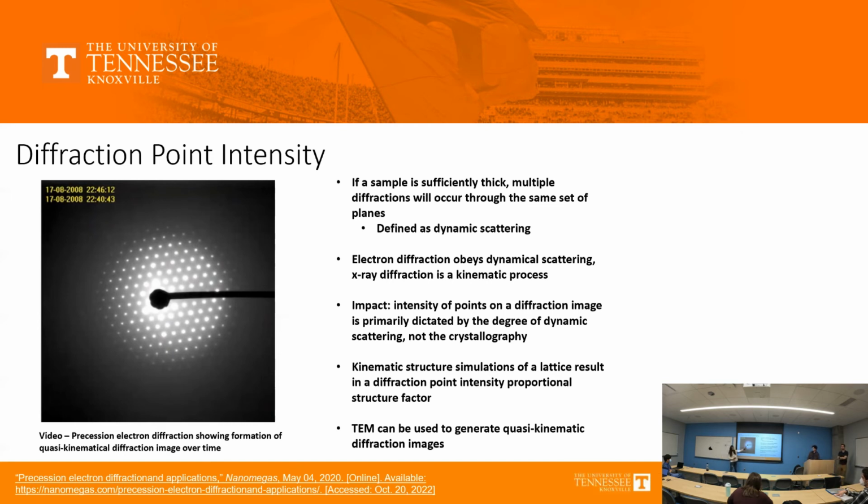Now you convert into kinematic. That means I am talking about one diffraction point now. So this thing should be sort of clear, and I will touch the base again. And I will give you a roadmap after everything, of what the key points are that you need to keep in mind while doing your TEM.